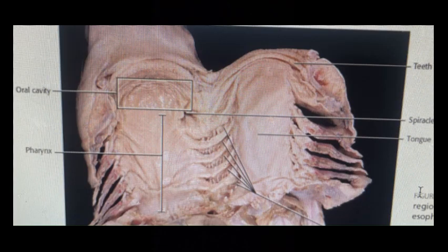Hello everyone, I will first be talking about the digestive anatomy of the shark. So first, along the jaws, sharks have teeth, which are derived bone coming from the mesoderm, the ectoderm, and neural crest tissues. Sharks have teeth because they actually chew on their food instead of filtering. They still filter feed on plankton and such, but they are also at the top of their food chain, because their teeth allow them to eat different sea creatures, like bony fish. And they continue to regrow teeth after they fall out.